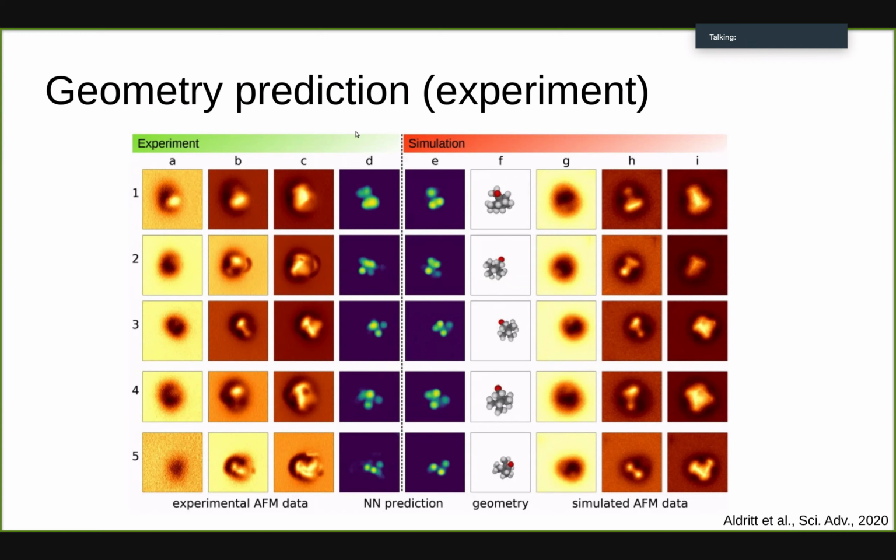Yeah, I'm not sure I fully agree with that. But so, for example, in this case, what you could do is match the simulated AFM images with the experimental AFM images. You probably get a good idea what the orientation is, right?